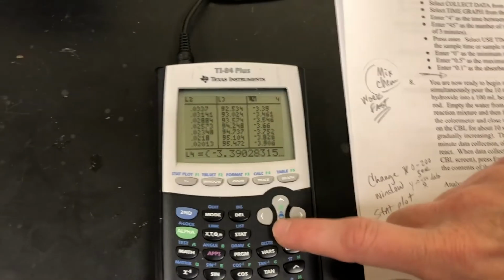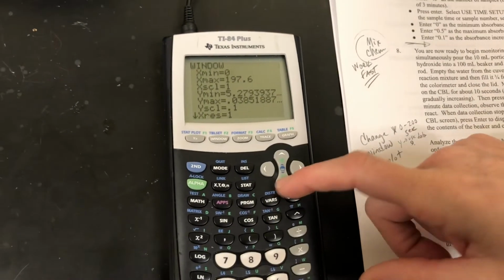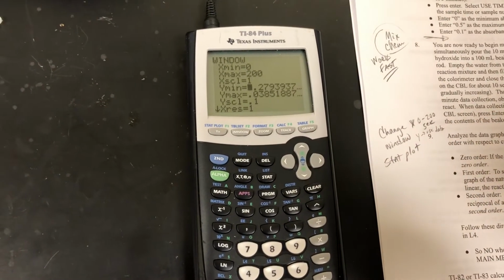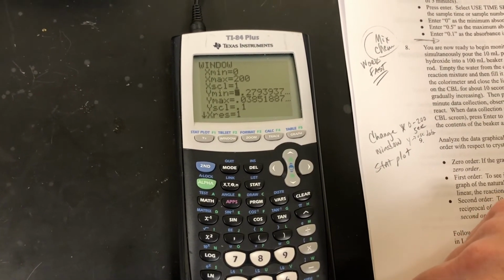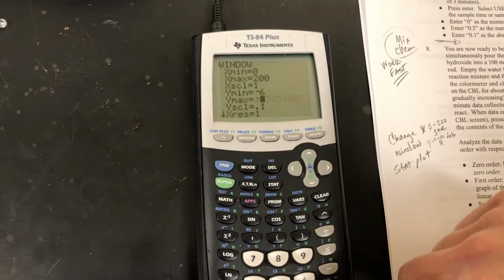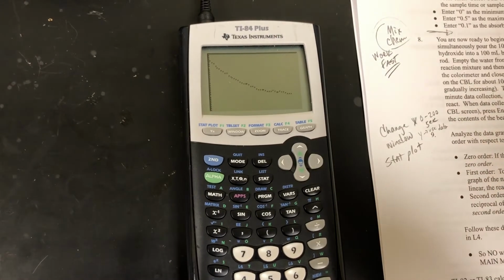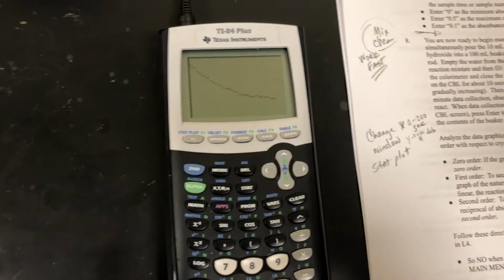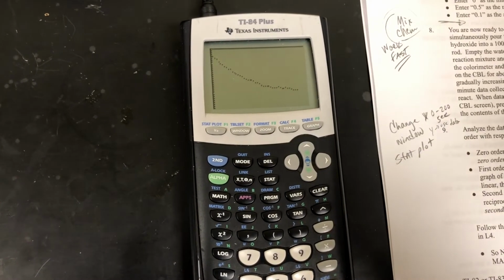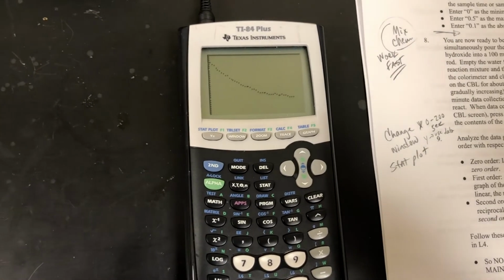Okay, so to do that, I'm going to go to Window. For Xmin, X is our time, so I'm going to go from 0 to 200. And that'll be a little bit more than we need. For our Y, the lowest was like -5 point something, so I'm going to say -6 to a max of -3. And that should cover all the values for the plot that we're looking at right now. Now if we graph it, you can see it actually shows up in our window, and it's better, but I still don't know that I would call that linear. If this was linear, it would be first order with respect to the reaction.